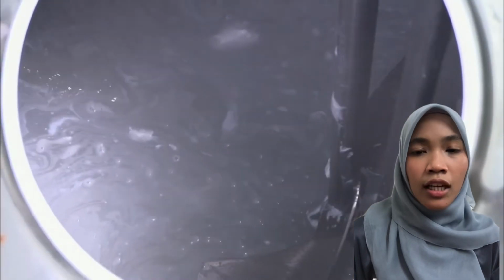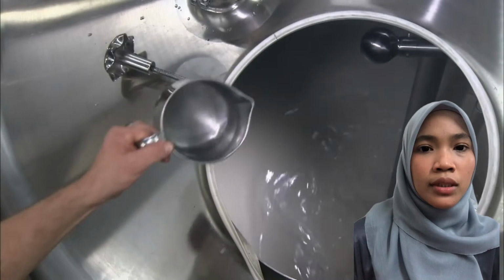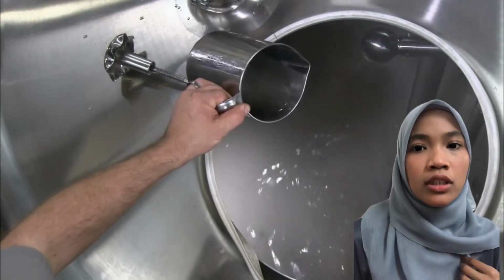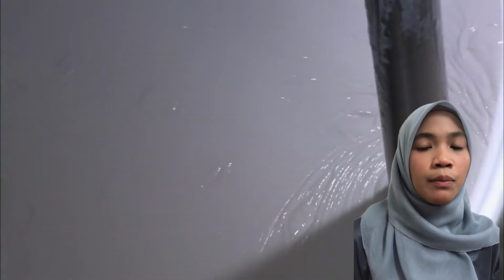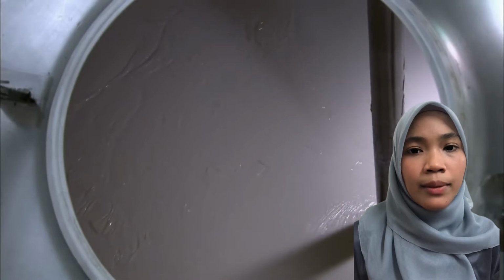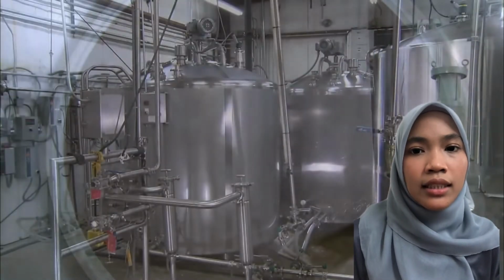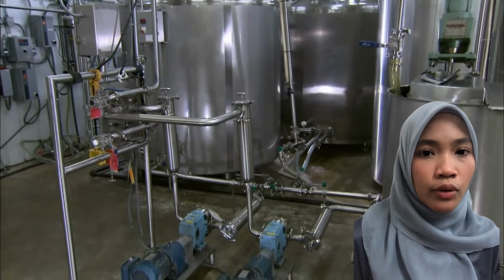So here it goes. During cosmetics production, chromatography systems are typically used in the initial part of the process during ingredient discovery and purification. Active constituents used in cosmetics can either be synthesized in a laboratory or extracted from crude natural products.